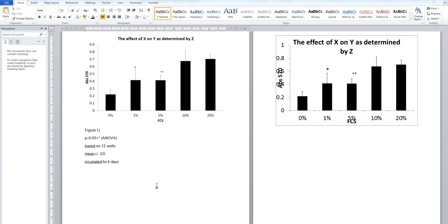So some last minute tips that I've been told you need to do for this assignment. You need to present data of your 3 experiments, MTT, Crystal Violet and Immuno. Immuno, you should be putting in 4 pictures, and I've put some pictures online if your experiment didn't work. You want to quantify the percent positivity in those 4 images. You should know how to do that. So identify what percent positivity in the 4 different images.